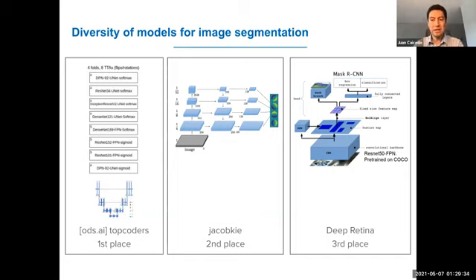The innovation that they made is that they replicated this exact architecture in 32 different models, basically, because you can choose how many layers or how many filters or what's the resolution of each. So they have an ensemble of 32 different U-Nets.